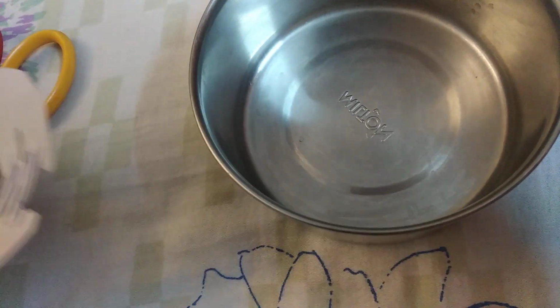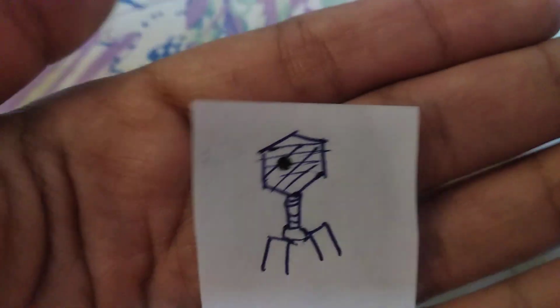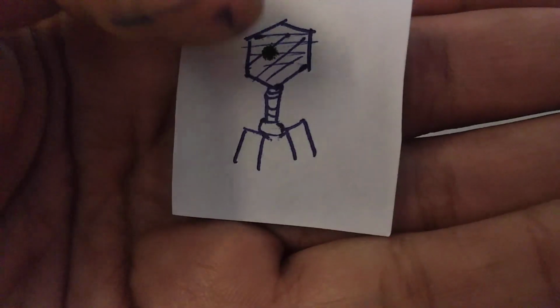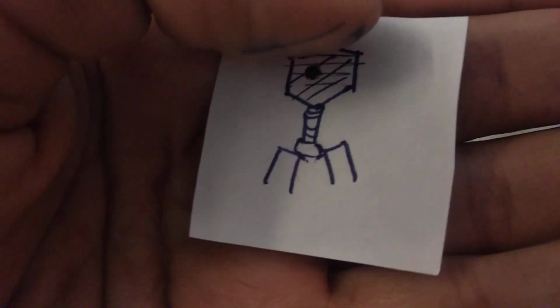Now let's introduce this into our host. So this is a bacteria, and I'm going to introduce my plasmid into the bacteria using one of the many techniques that exist. Also, you could use another cloning vector, not host, known as bacteriophage, which has a very high copy number per cell. I could introduce my foreign gene of interest into the bacteriophage and also introduce this bacteriophage into our cloning host. But at present, I'm using a plasmid.